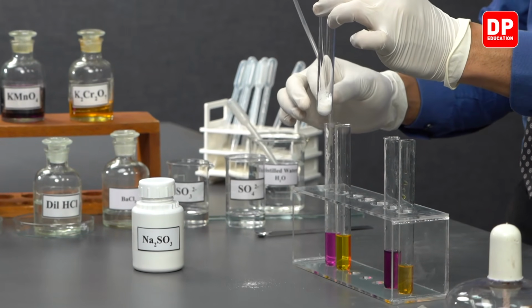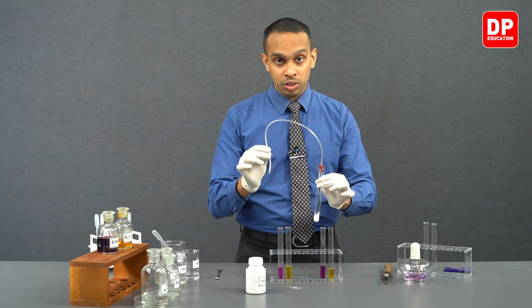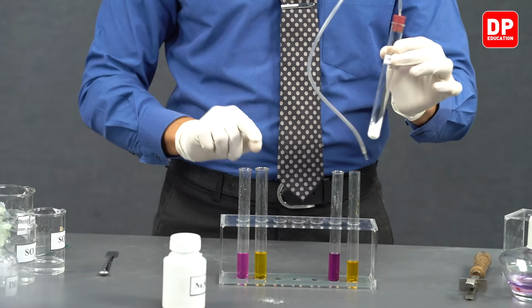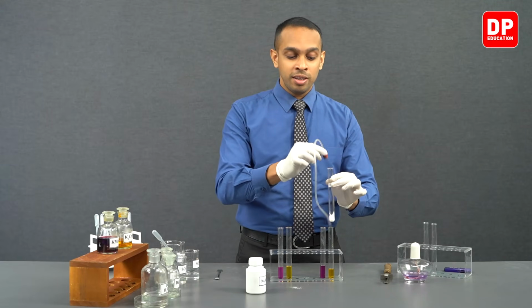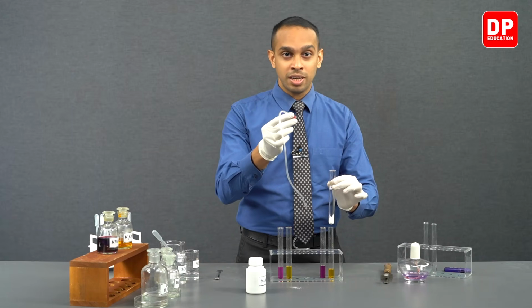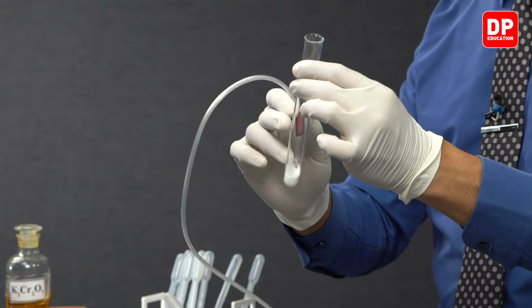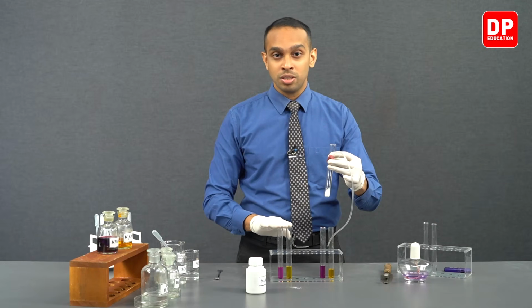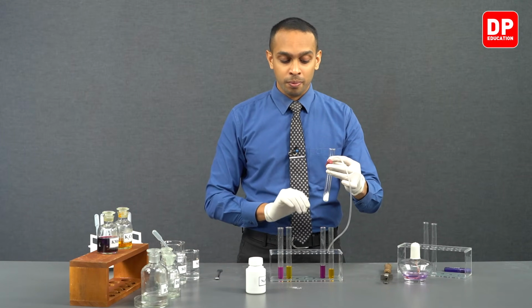So we can easily use this delivery tube to introduce the sulfur dioxide gas that is produced into each of these oxidizing agents. We are going to be using this rubber stopper connected to the delivery tube to make sure the sulfur dioxide produced here gets delivered directly into the solutions we wanted to introduce sulfur dioxide to.